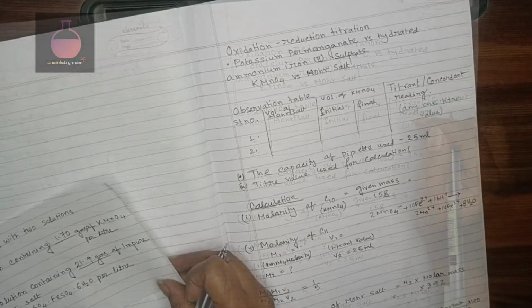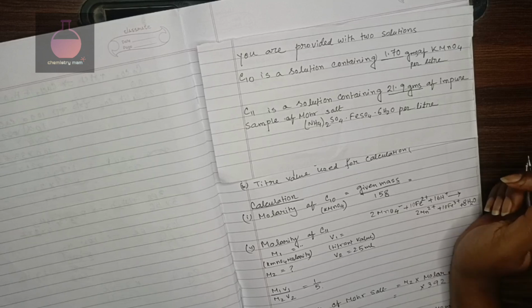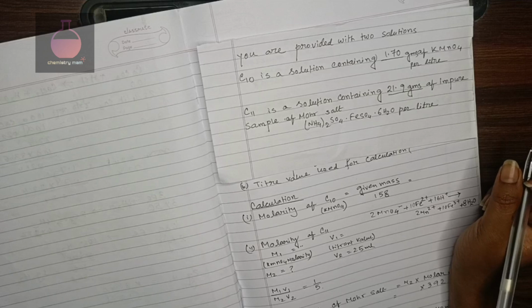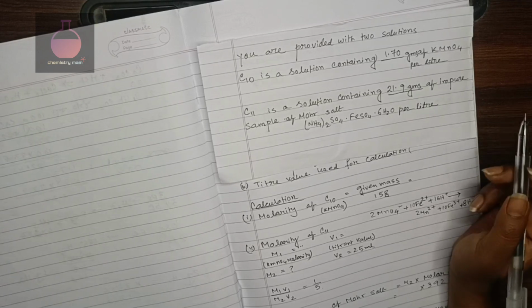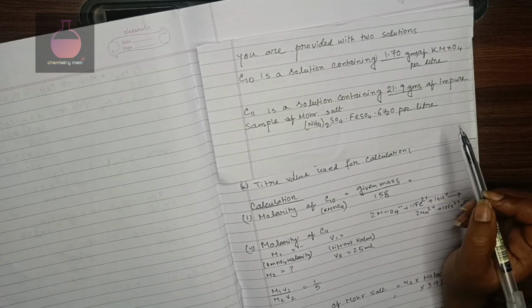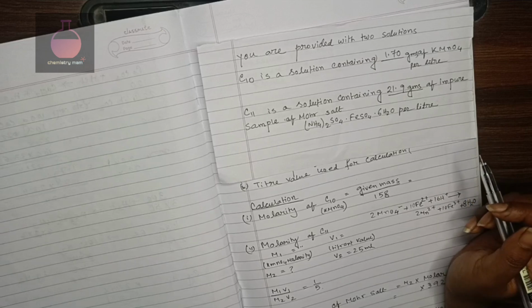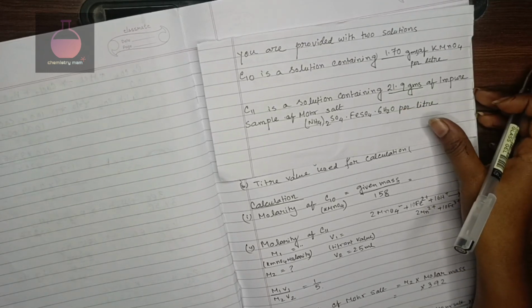So first I am going to tell you. You will be provided with a question and some calculation will be related with it. The question is, you are provided with two solutions. C10 is a solution containing 1.70 grams of KMnO4 per liter. C11 is a solution containing 21.9 grams of impure sample of Mohr salt, formula (NH4)2SO4.FeSO4.6H2O, per liter. Now I am going to start the calculation.